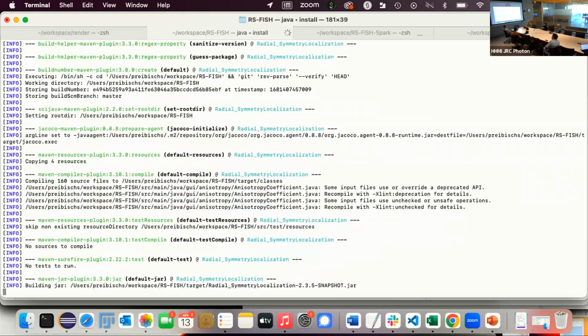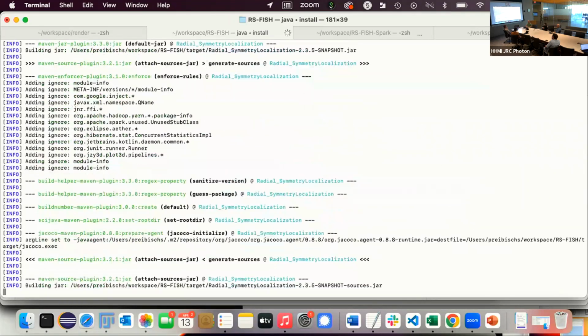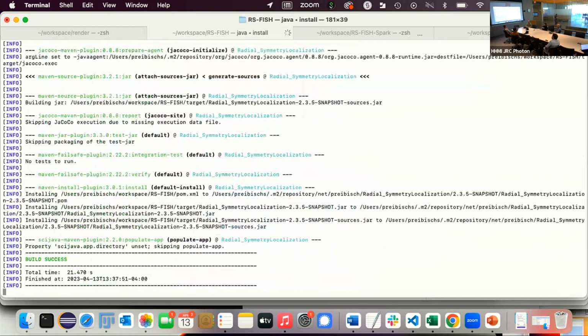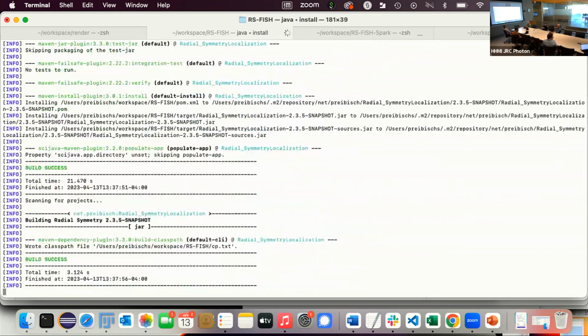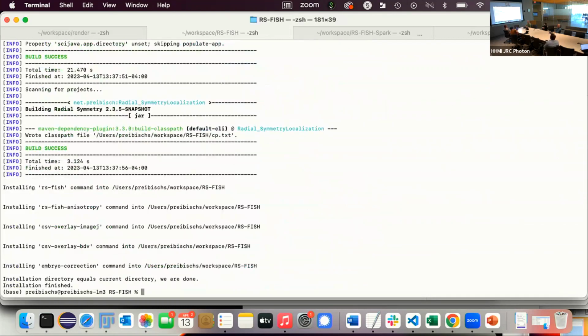I don't know how many Windows people like to use the command line, because that's a weird combo, that you would use Windows in the first place. There are exceptions, I know, but sometimes you have drivers, or so, you have to use it, right?